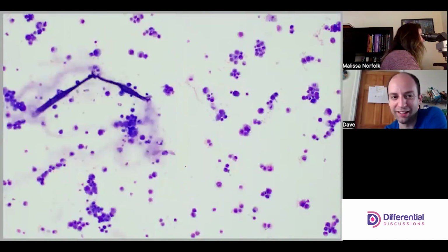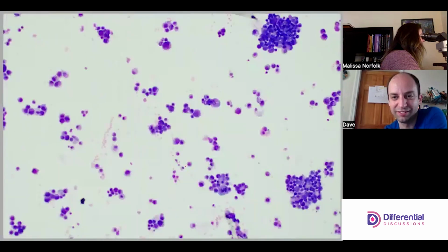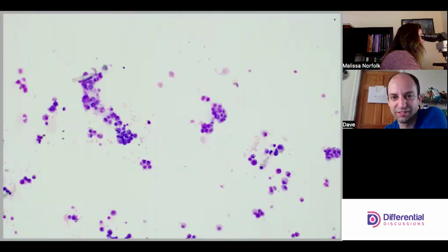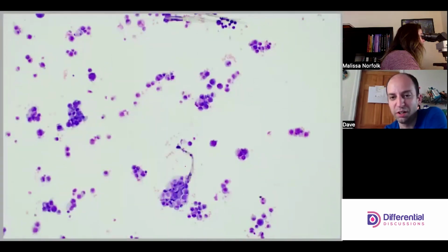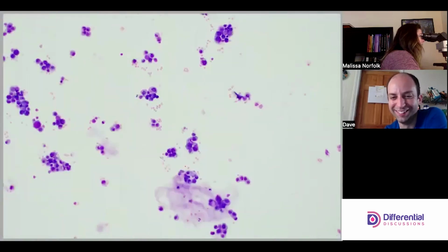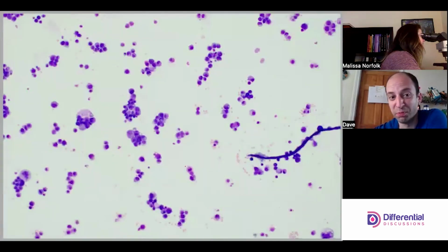This is really bad. So we're looking for clumps of cells. I'm not sure there's a good area anywhere really to start. I think the bad stuff is going to follow us a little bit here, right?